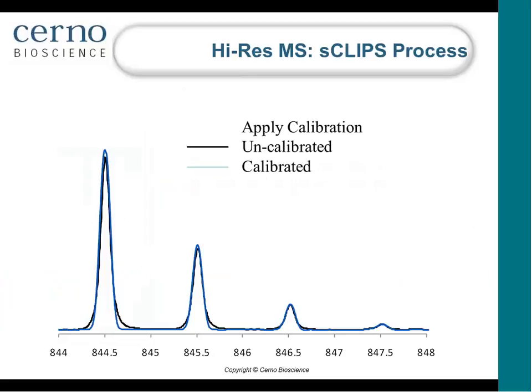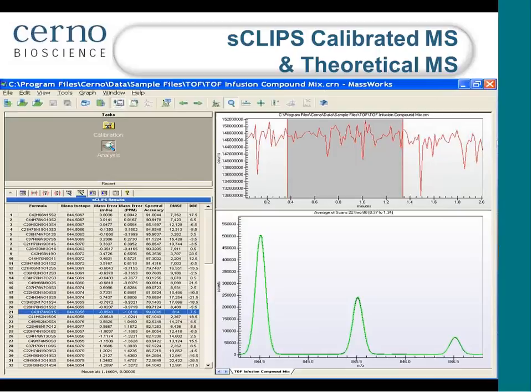And that perfectly defined mathematical peak shape function would then be used to calculate the theoretical mass spec for any particular formula candidates, so that if we have the right formula candidates, they better be right on top of each other, subject only to hopefully random measurement noise, so that we can perform a full spectral match in the raw profile mode without regard to the particular instruments that did the measurement, which brings its own particular peak shape function. We have removed the peak shape function from the consideration completely, and which would allow us to measure and compare different elemental compositions.